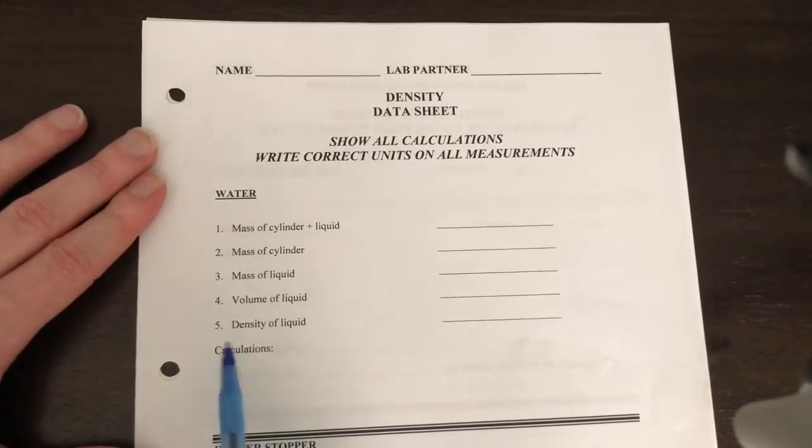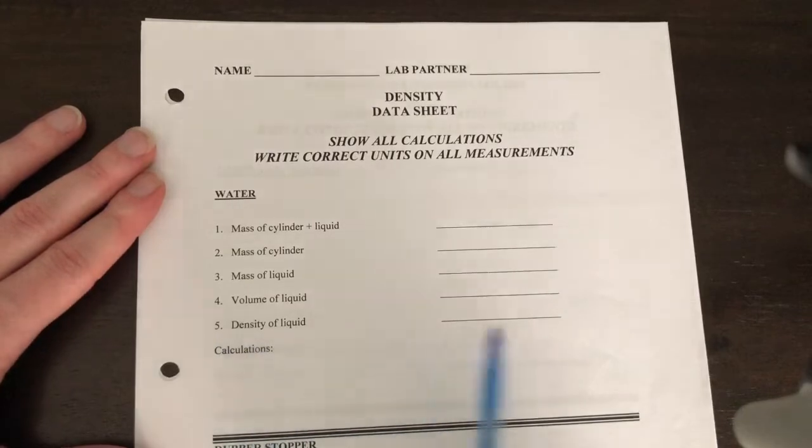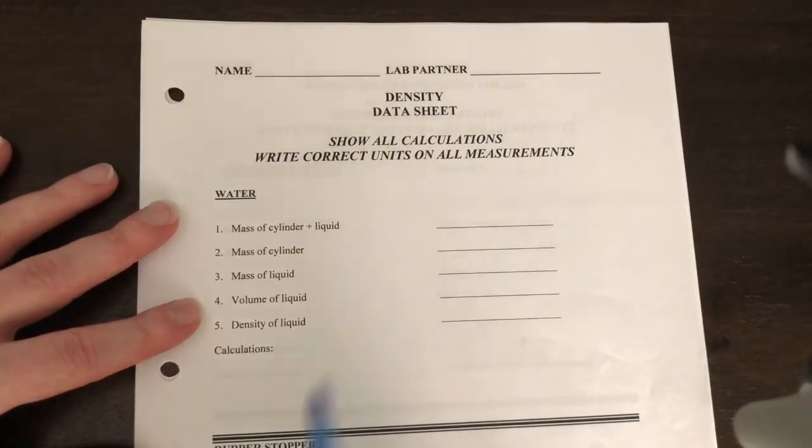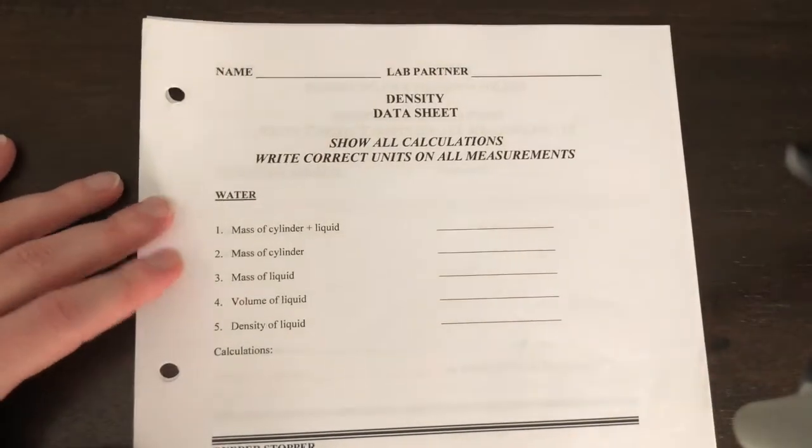To find the density of the liquid, the density of water, we take the mass divided by volume. So we're going to do number 3 divided by number 4, and we should get something really close to 1.